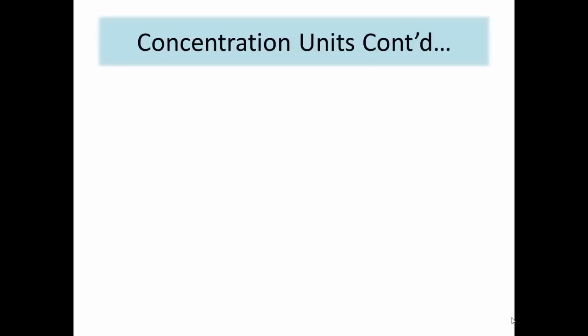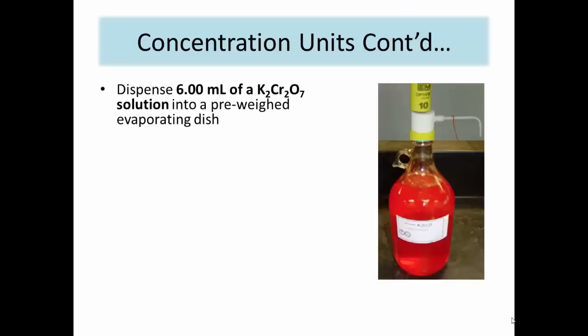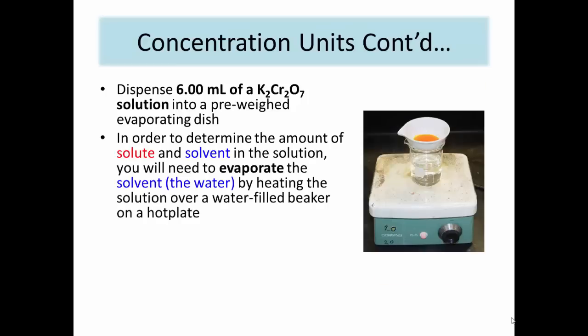Set a 150 ml beaker containing approximately 75 ml of water on a hot plate and bring it to a boil. Measure the mass of an empty evaporating dish on an analytical balance and record the mass in your data book. Dispense 6 ml of the saturated potassium dichromate into the dish. Quickly, before any of the solution evaporates, weigh and record the mass of the evaporating dish containing the 6 ml of solution. Place the evaporating dish and contents on top of the 150 ml beaker, which should now be at a gentle boil. This process will start the evaporation of the solvent in order to determine the mass of the contained solute.